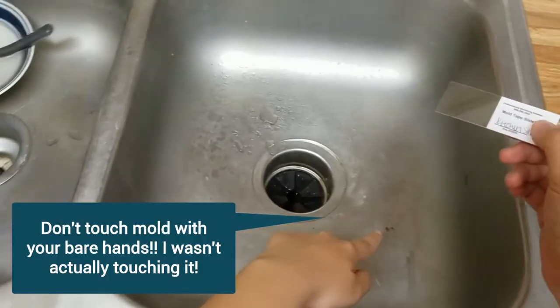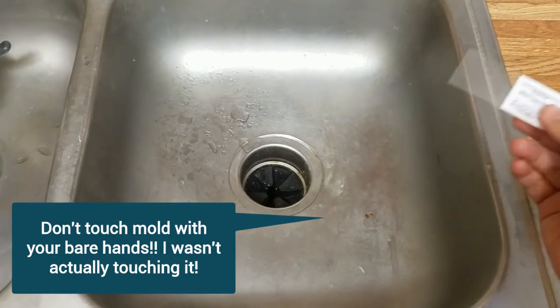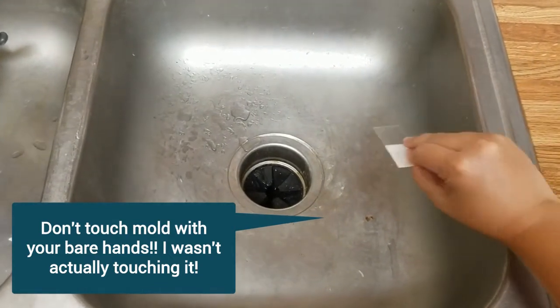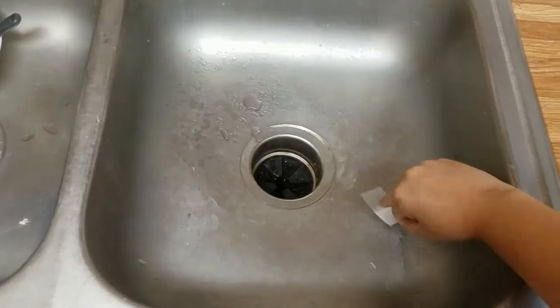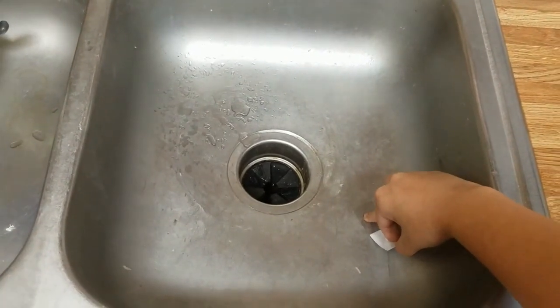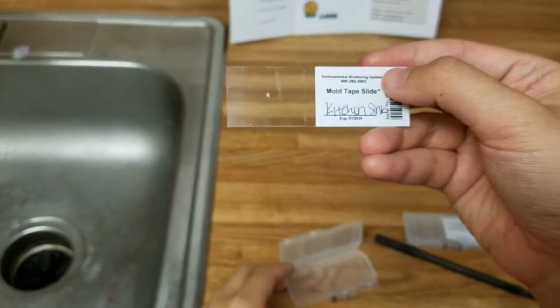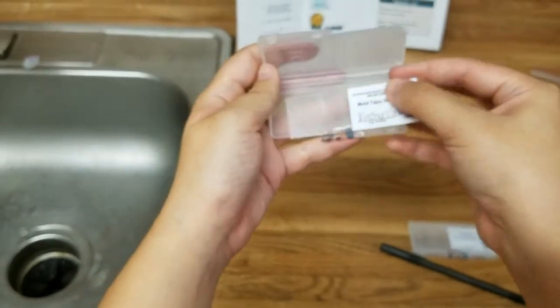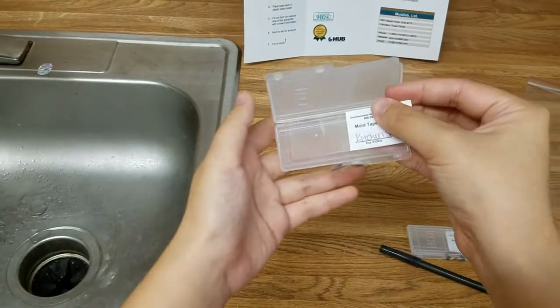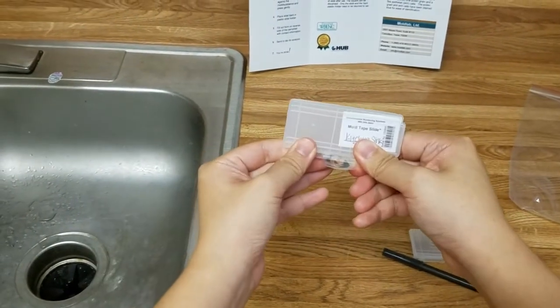You can see over here — that's the place I'm going to stick it on. I'm just going to stick it, press against it, and lift it up, and there you have it. Next, we're just going to place this back into the case, and we're done taking the sample.